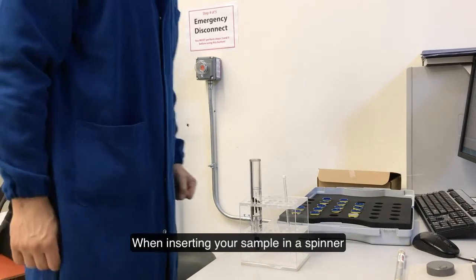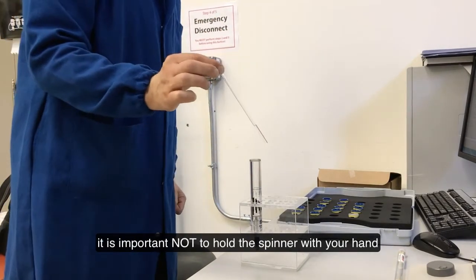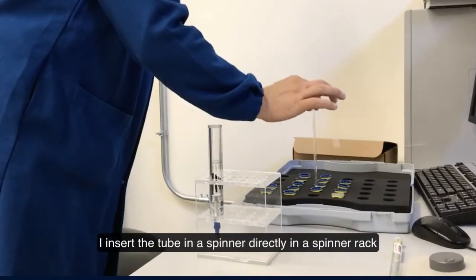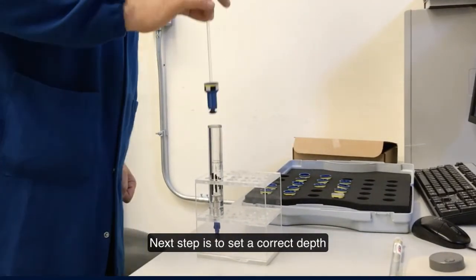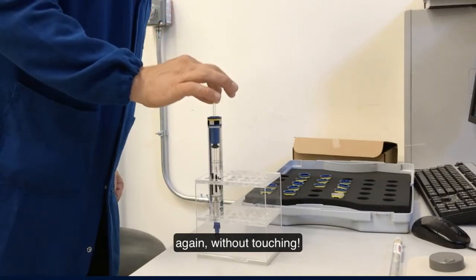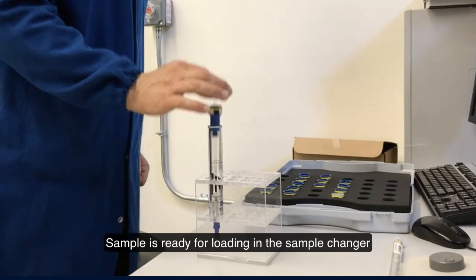When inserting your sample in a spinner, it is important not to hold the spinner with your hand. Instead, insert the tube in a spinner directly in a spinner rack. Next step is to set the correct depth — again, without any touching. The sample is ready for loading in the sample changer.